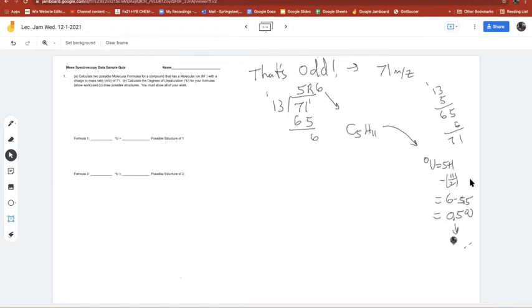So that's not good. That should clue you to, oh yeah, wait, I can subtract a CH2 that weighs 14 and add a nitrogen. So I get C4H9N. All right, now it's going to work out. I think this is a good one. Let me double check it though. Discount, double check. Carbon times 4 is 48 plus 9, plus nitrogen 14. That's 57 and 14. 71 looks good.